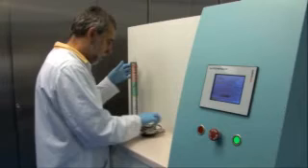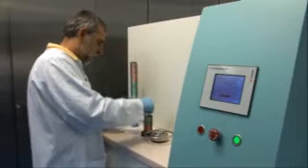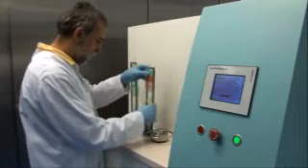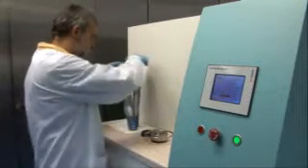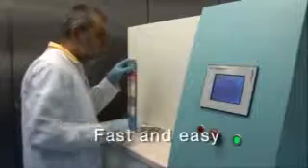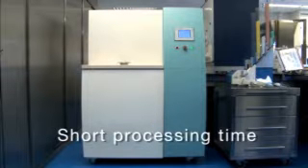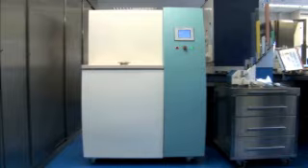The rack is placed in the generator of the tissue processor. Then, simply press START. The total process only takes two and a half hours. By using supercritical CO2, the samples are ready to be prepared with paraffin.